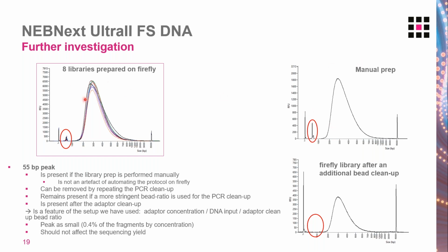So this is the same data as I showed previously on the left. I looked at a manual prep. We still get this peak if I perform a manual prep. So this is not an artifact of automating the protocol. We can remove this peak if we perform an additional PCR cleanup. So in this, see the peak has been removed here in this lower figure.